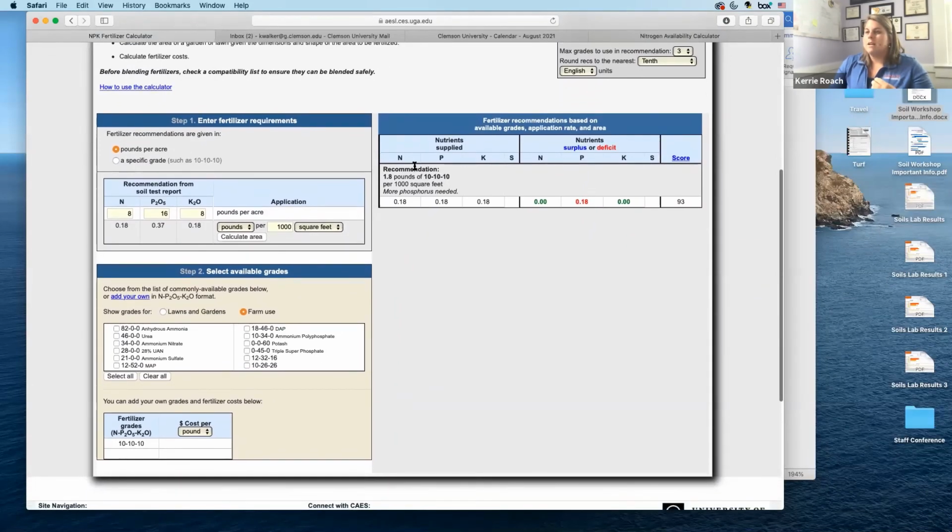So it's really just so important that when we get that soil test report, we don't just say, oh, okay, I did my soil test, check. Take that test, get a hold of your agent, take it with you to the feed and seed, use some of these tools, help try to figure out a real application to your actual production, how you can use that soil test. Because sometimes it's a little daunting and it doesn't all come out as, oh, you need to apply 50 pounds of 10-10-10.